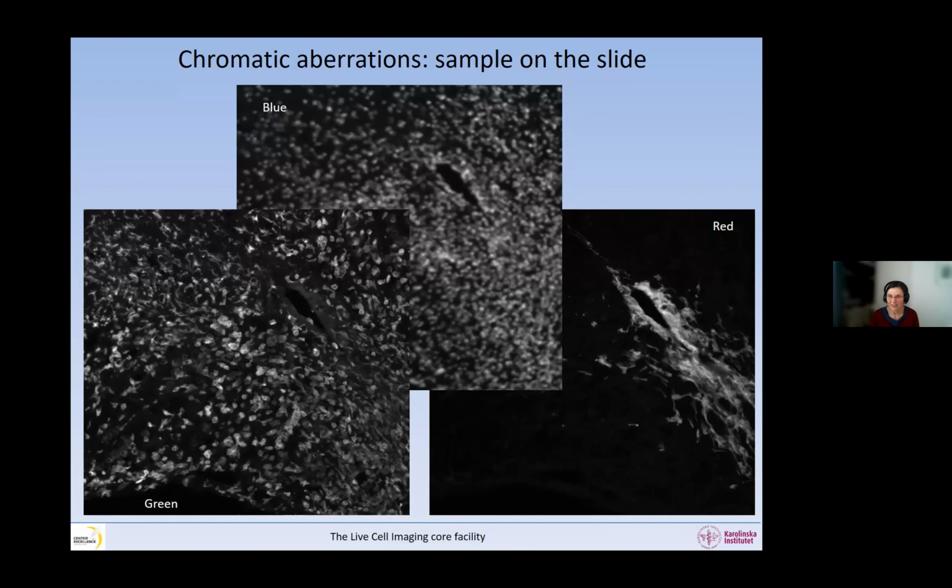You will see something funny and go like, oh, background, whatever, discard the thing. Don't discard these sort of things. You see something strange, address it, okay? This is something that you will not notice until you compare side by side or you have some experience.